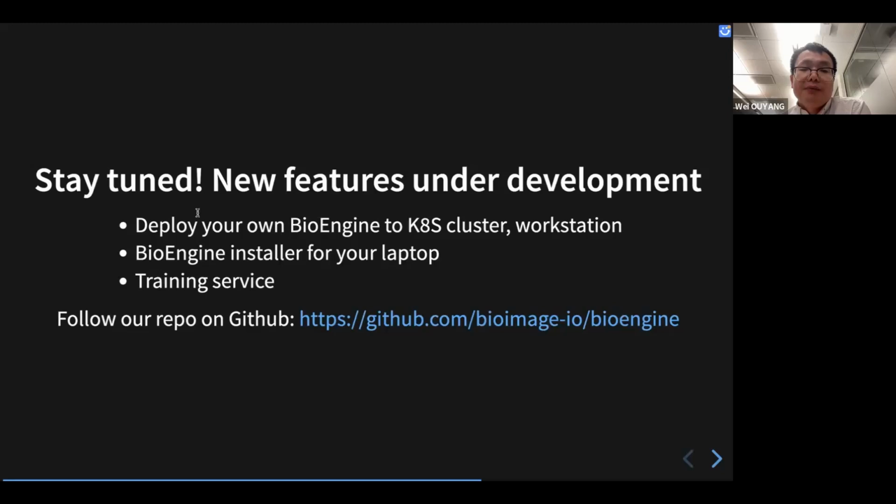As I mentioned, there are a few new features under development. We are currently working on a deployment toolkit where you can deploy your own BioEngine under a Kubernetes cluster or your own workstation. And Jeremy is also gonna work on, we have been discussing, a nicer installer with a GUI where you can configure the BioEngine and select which models to install, ideally on your own laptop. You can download, install, and then a GUI pops up, and you say, okay, I want to spin up a BioEngine with this list of selected models. Then you can connect with your own other software, a web app, locally, right? So entirely locally, you have BioEngine on your laptop or another workstation, which you configure through a GUI and then run through other applications.